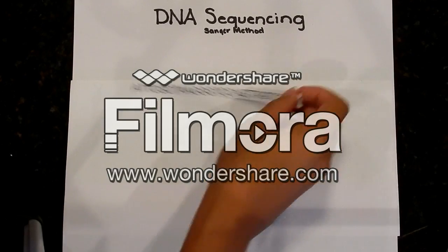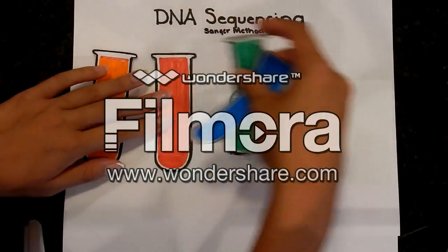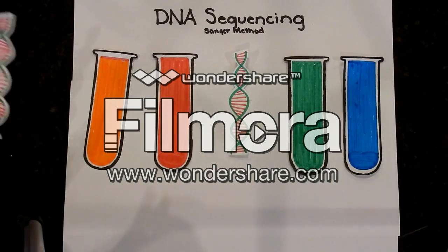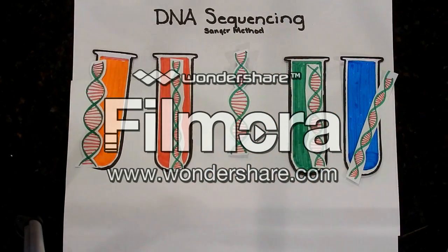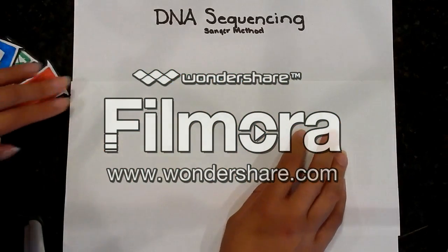To start, we have to have the particular region of DNA we plan to sequence, and then split it up into 4 separate tubes. But to divide the distinct strand perfectly, we need to use PCR cycling to clone the DNA strand sequence so that it will use the same sequence throughout the test. The setup of PCR and the Sanger method are very similar.